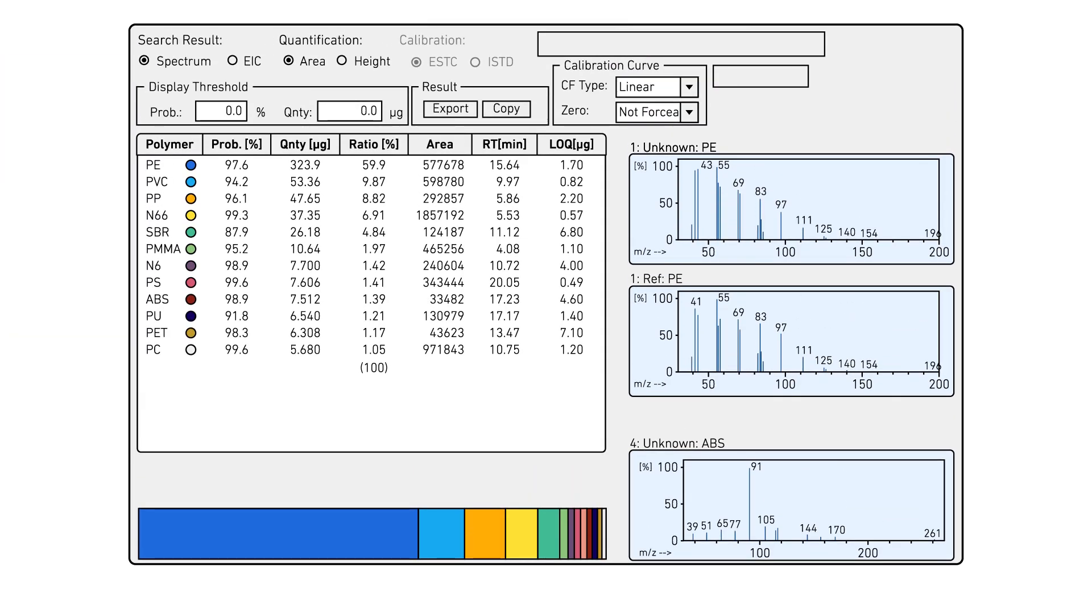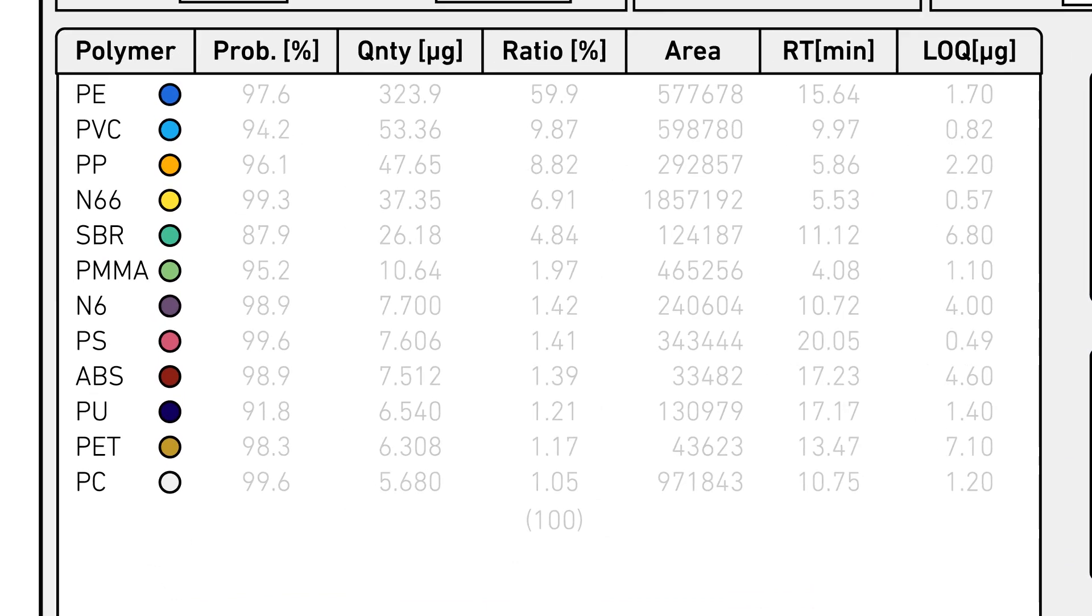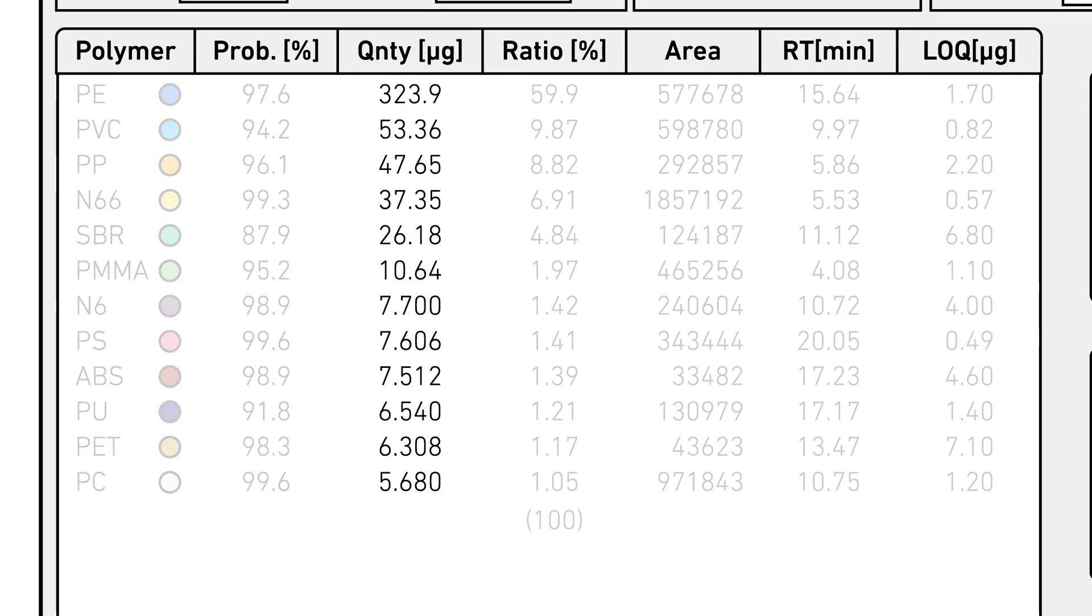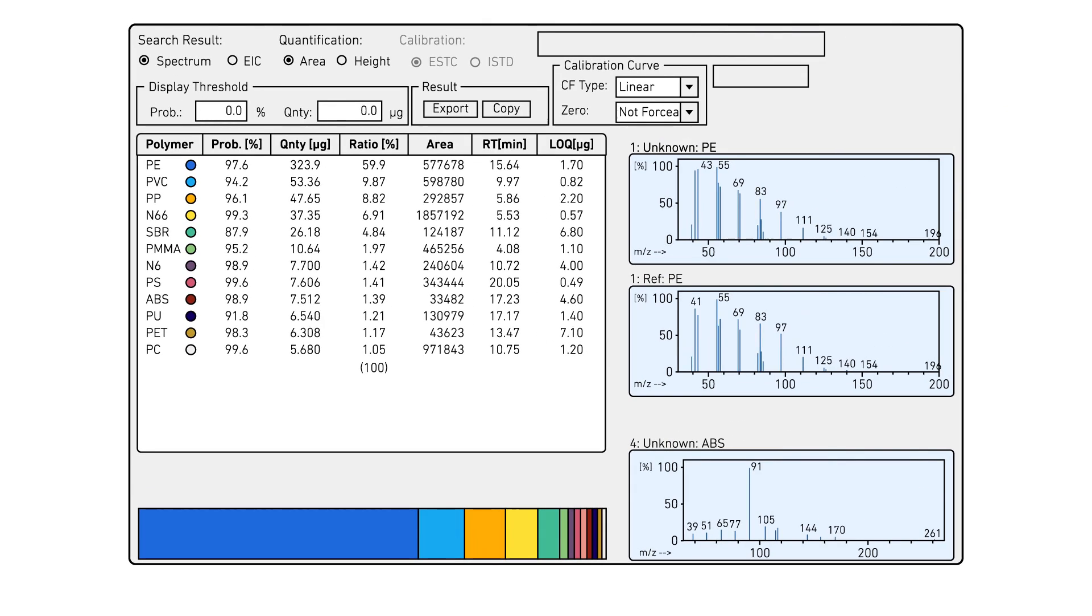Within a few seconds, F-Search MP displays the polymer name, probability match percentage, quantitation result, relative amount percentage, peak area, and LOQ. F-Search MP also provides a bar graph of the relative percentage amount of the quantitated polymers in your sample.